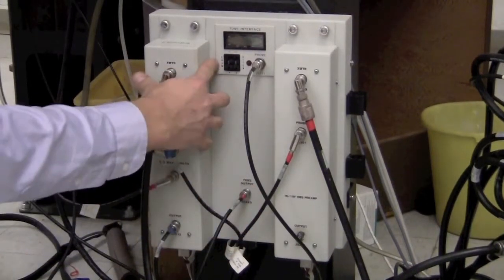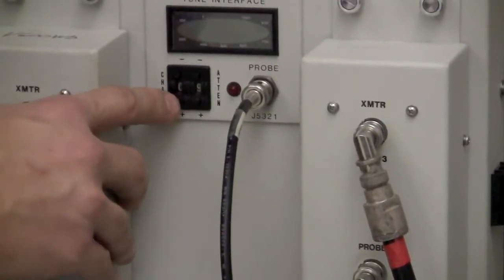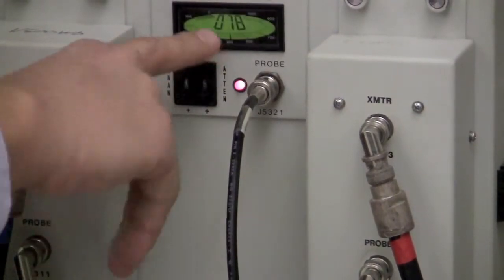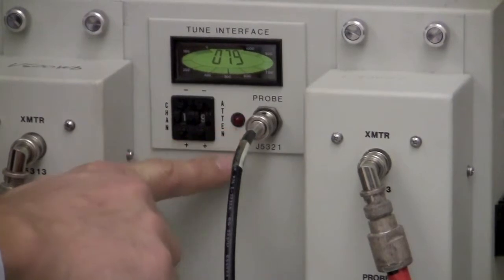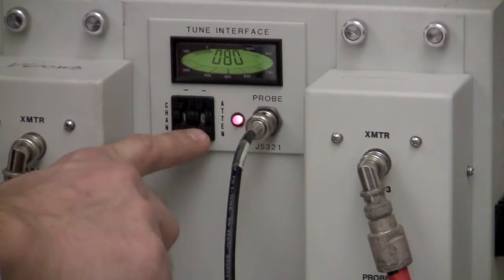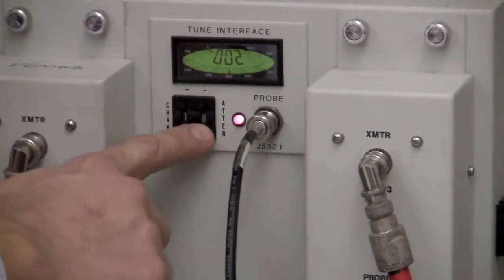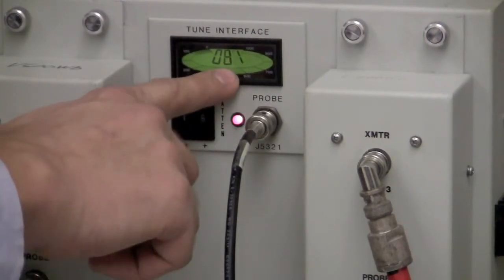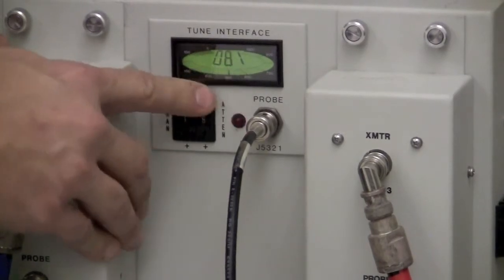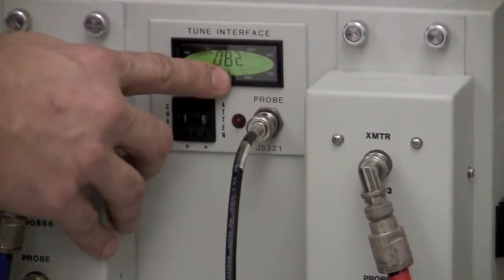Switch the channel to the number set up in the software — currently channel 1 is protons. A number should be displaying on the tune interface. The attenuation setting controls sensitivity: the larger the number, the more sensitive the interface is. At the most sensitive setting of 9, we see a value like 81, which means it's not perfectly tuned. The smaller this number, the better tuned it is.